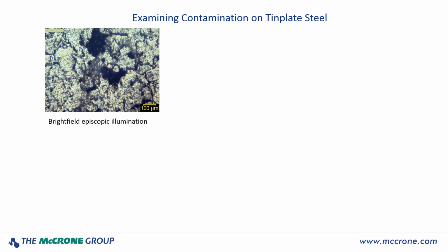So let's take a look at some contamination on tin-plated steel. The surface of tin-plate steel is quite smooth and bright, and in bright field episcopic illumination, it appears quite bright, and you sometimes have to reduce the intensity of the illumination to see the structures better.